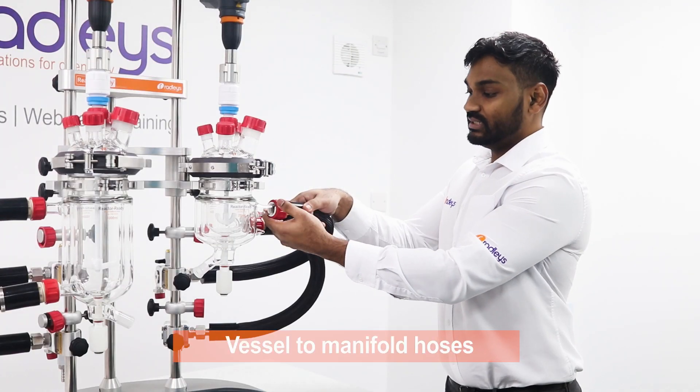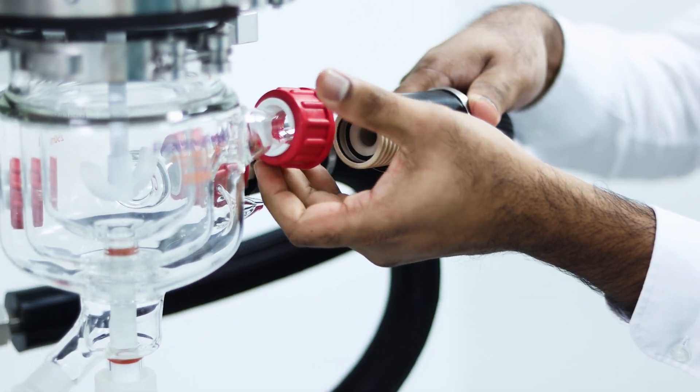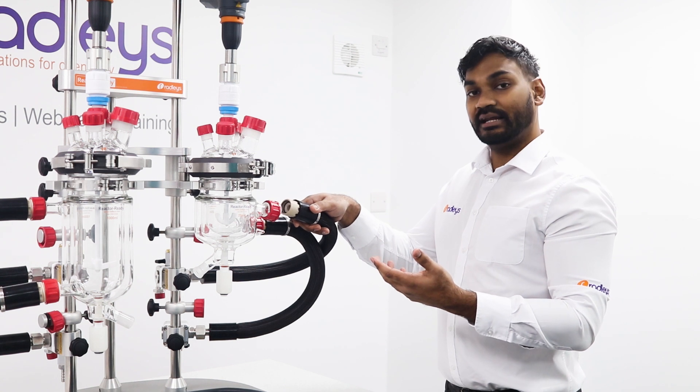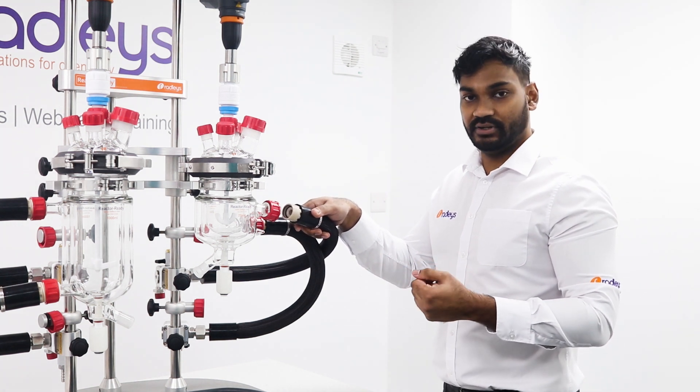The vessel to manifold hoses are made from PEEK, which is a fluoropolymer that allows for tools-free connection to the glass vessels and reduces the risk of chipping the glass on installation or thermal fluid leakages when the circulator is running.